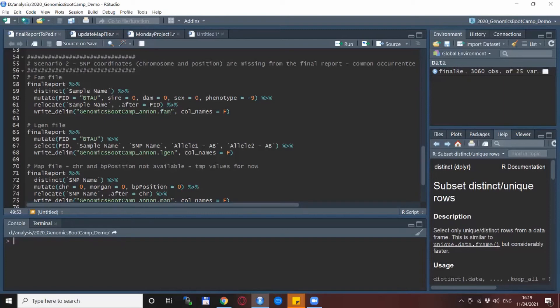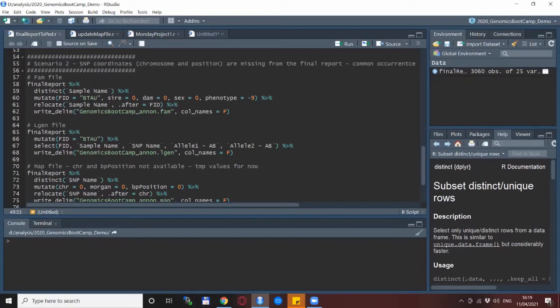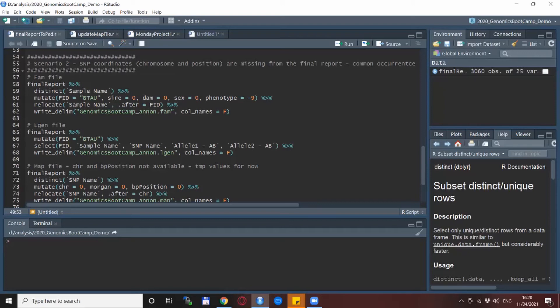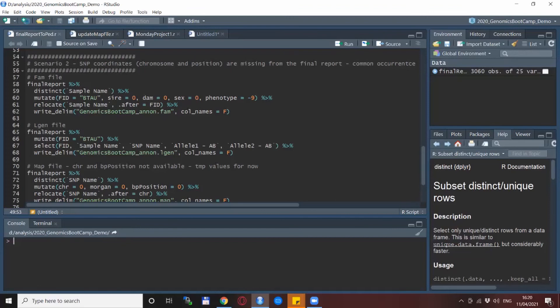And now for scenario two which unfortunately is way too common. But here basically we use the same approach, we still do for the creation of FAM file, LGEN file and MAP file and we still transform these with PLINK. The catch is that we need to be a little bit more inventive when it comes to replacing the missing values because of course if there are some columns missing from the final report we still need to put there something because PLINK actually needs them so it can function properly.